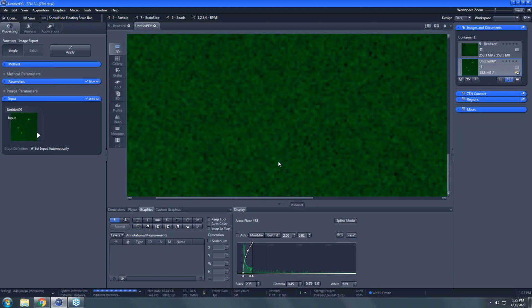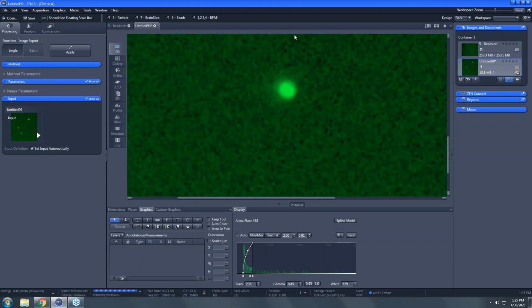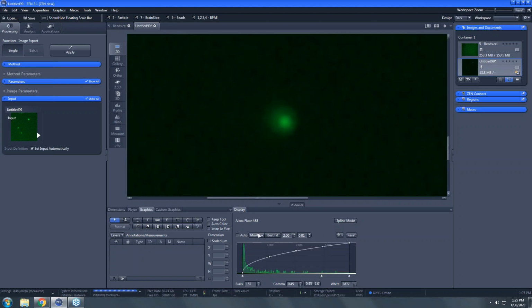Sorry about that. For the folks watching, there's a slight delay for Nicole. She is not only doing all the mouse driving, but she's also dealing with a kind of half-second lag. So if an image flies off the screen for a second, it's because of the lag that Nicole's got to contend with.